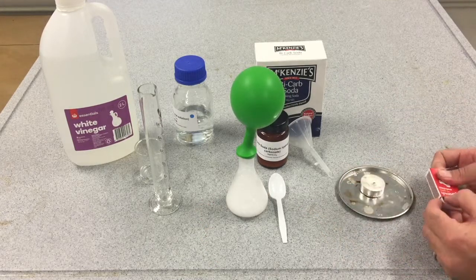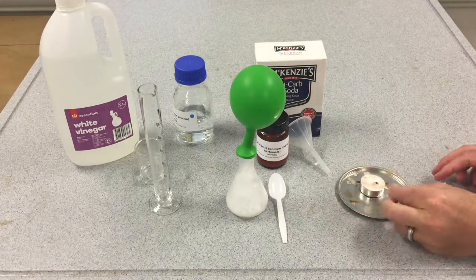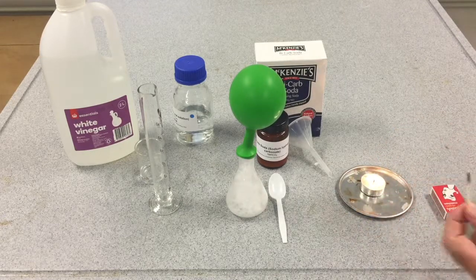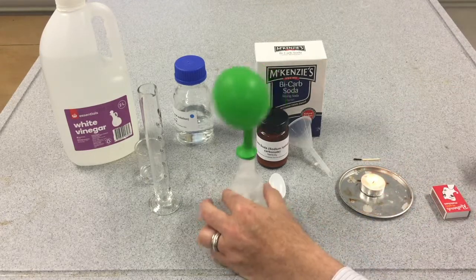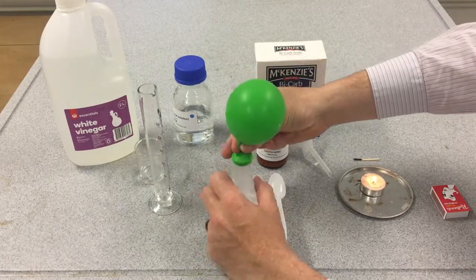The second part of the experiment is to light a tea light candle, and we're actually going to use the gas produced in the first part to see what happens to the lit candle. So twist the balloon to stop any gas escaping before you take the balloon off the conical flask.